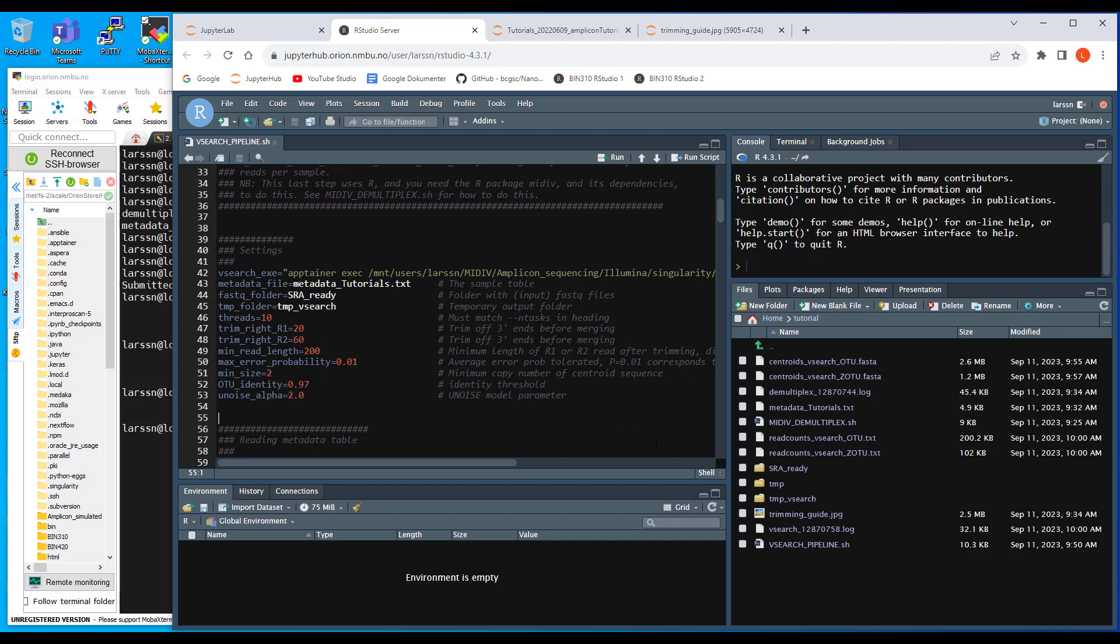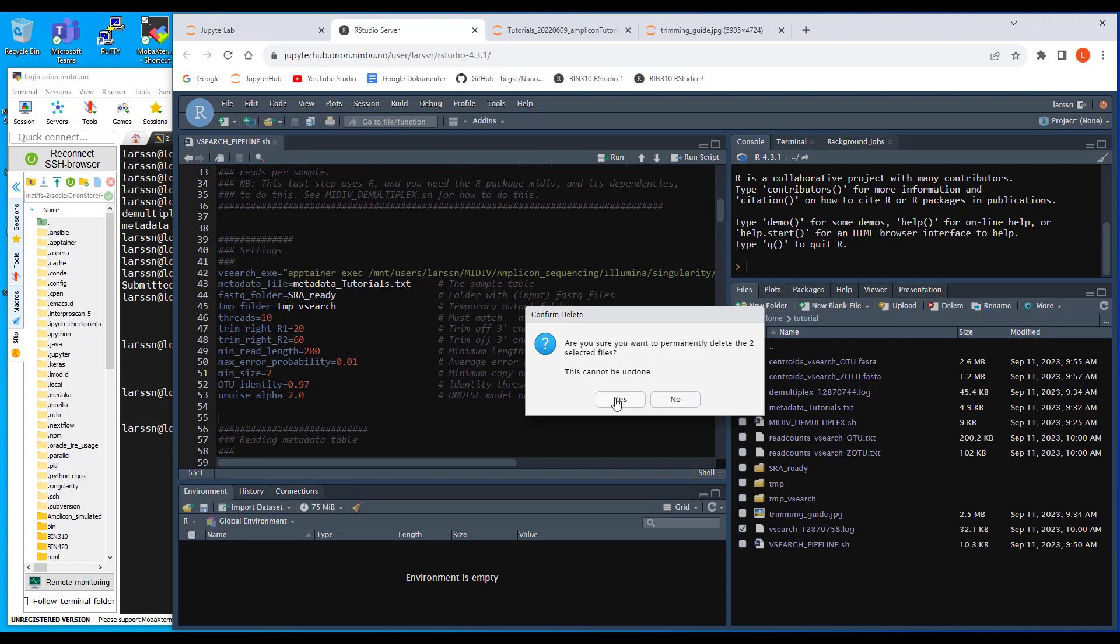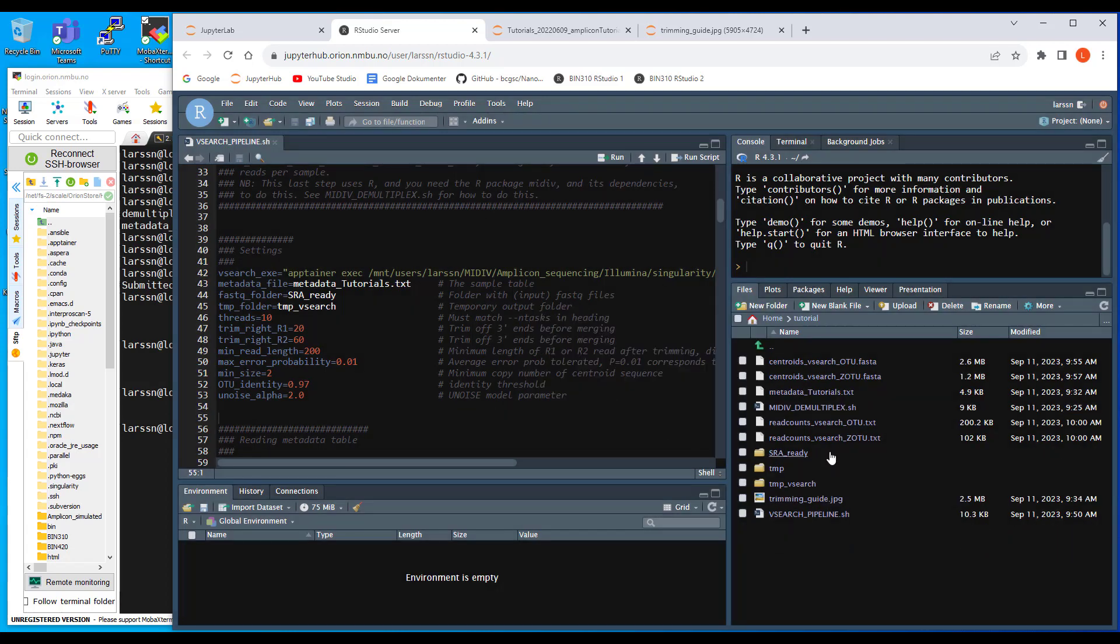So that should really be it. And as everything worked fine, I delete the log file. I also delete the log files. They only are important when things go wrong.